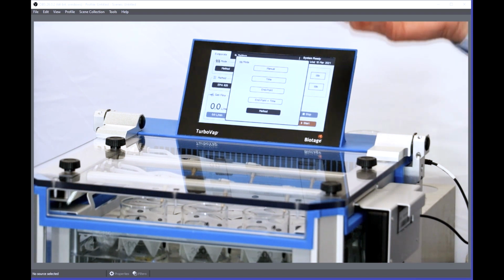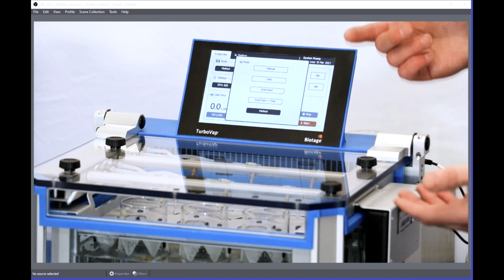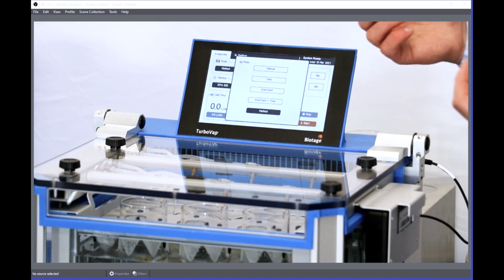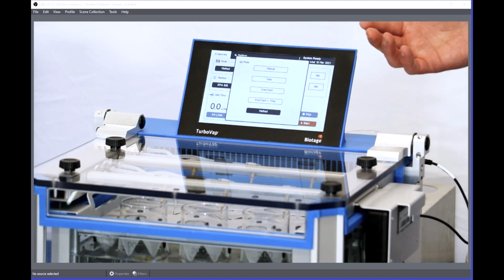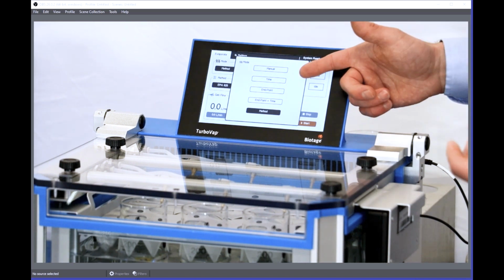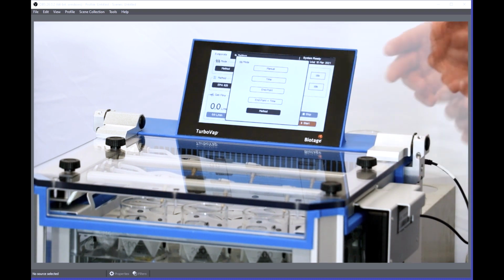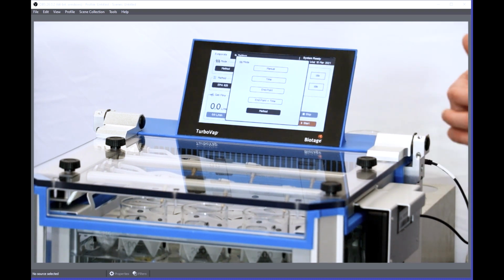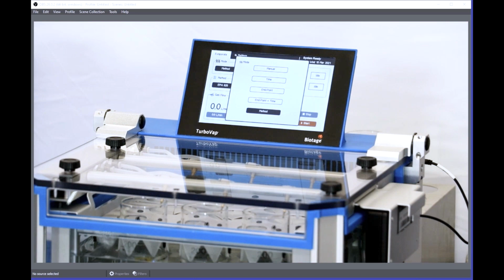I will take my solvents that I'm going to be using, the volumes that I'm going to be using, and the tubes. And what I'll do is I'll drive it manually and see how much pressure I need in the system to actually get an efficient, effective concentration. There is also a timed mode, and that's just a predetermined amount of time. So if you'd like to say 3 liters per minute of nitrogen blowdown over the course of 10 minutes, timed mode is perfect for you.